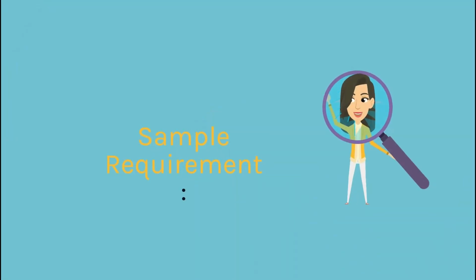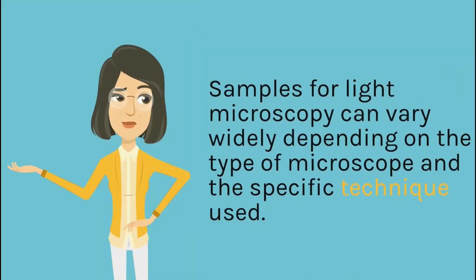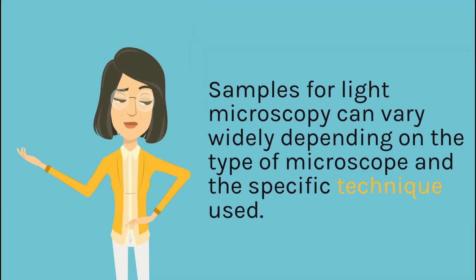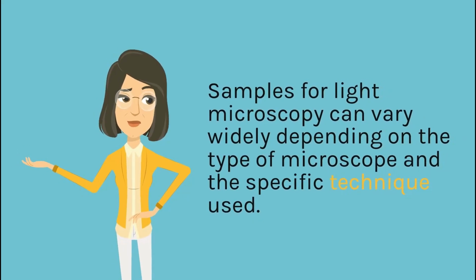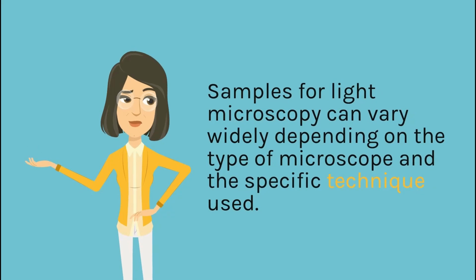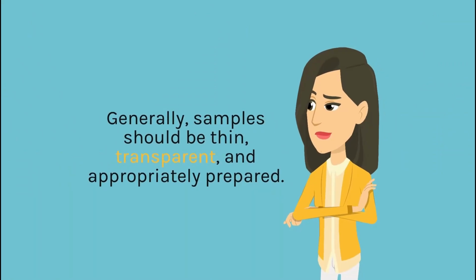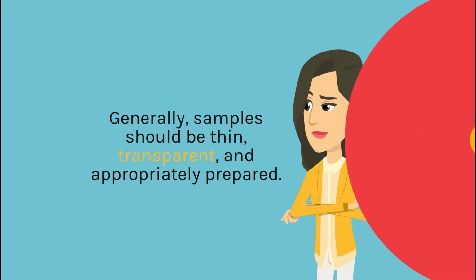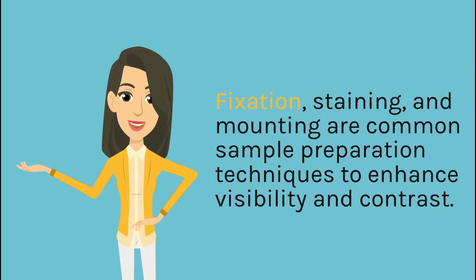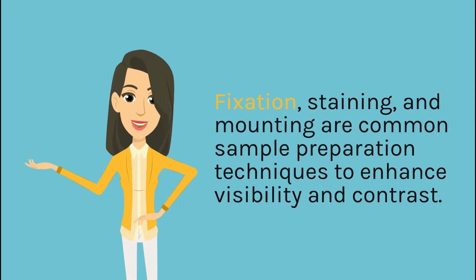Sample requirement. Samples for light microscopy can vary widely depending on the type of microscope and the specific technique used. Generally, samples should be thin, transparent, and appropriately prepared. Fixation, staining, and mounting are common sample preparation techniques to enhance visibility and contrast.